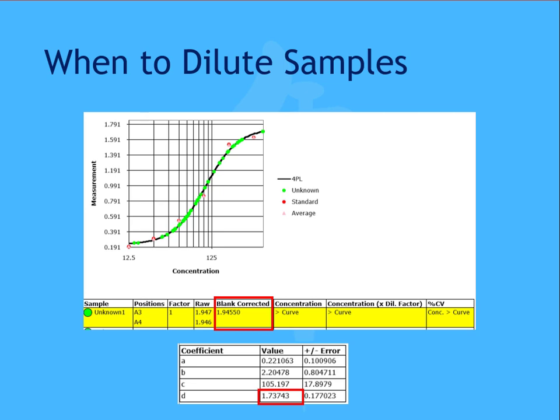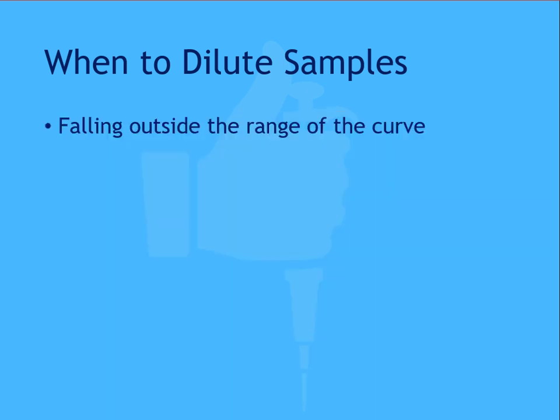Looking at the chart, we can see that as the y-axis value increases, the x-axis value also increases, meaning the result for unknown one is too concentrated to be measured. By diluting this sample, we may be able to bring the result back within the reportable range of the curve.